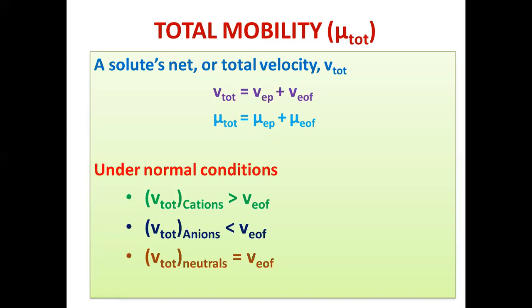And among the cations, the charge to size value will be used in order to predict the order of elution. Say lithium, calcium, aluminum, thorium, as I mentioned in the example. Lithium is lower charged, having higher size, right? So it is eluted last. Thorium is tetravalent. It is having lower size, so nu EP will be more. So it is eluted first. So thorium elutes first, aluminum next, calcium 2 plus next, then lithium.